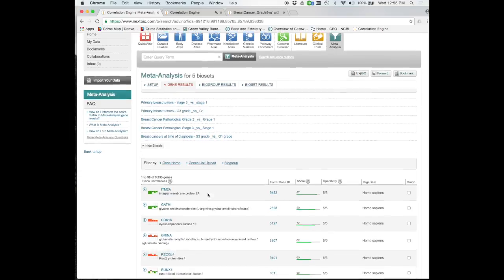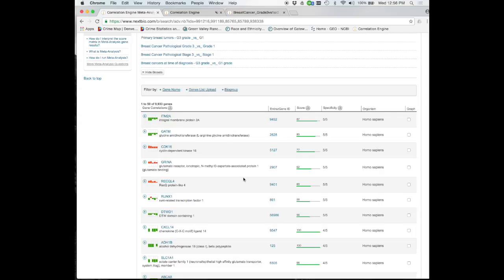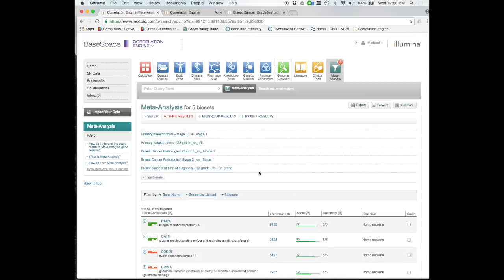Same kind of thing. So what I had them do is basically we generated this gene list, and I just did it very quickly, but I had one of my students who had a gene list of 58 different gene lists that he used for his meta-analysis. It was insane. I was like, you can't use all that, man. You gotta cut it back a little bit. It took him so long to process. But what I had them do is make their own gene list, and what you can do now is I can export this as an Excel file.